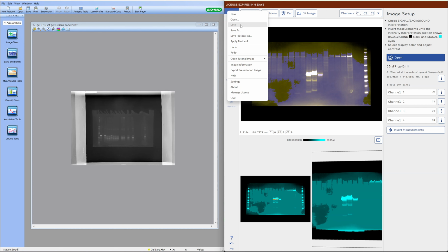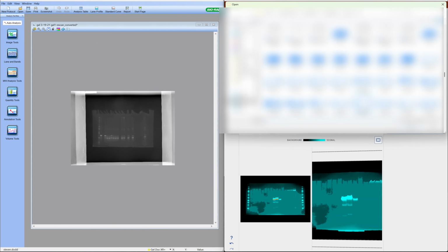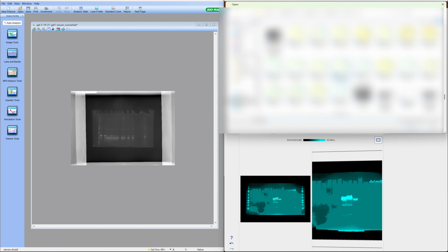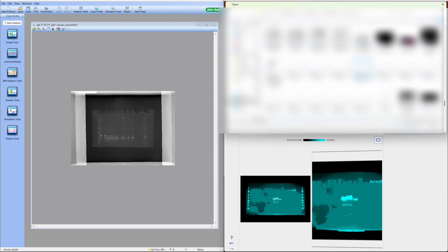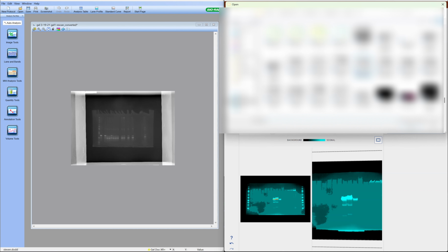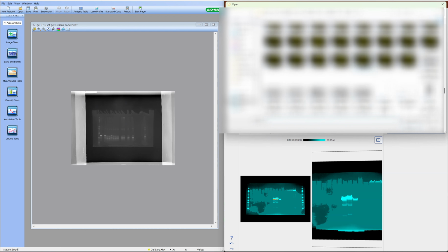So let's just open this within Phoretix as well. So this is gel 3, gel 319. I'm aware this is not the world's most interactive video at this point, and I can only apologise, but you are watching a video on Western blot analysis, so I don't know how much excitement you were expecting.